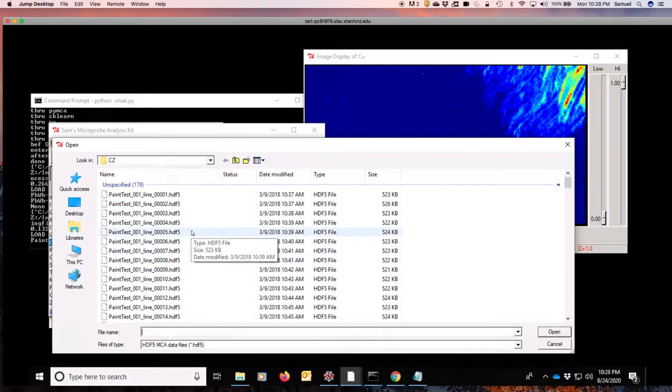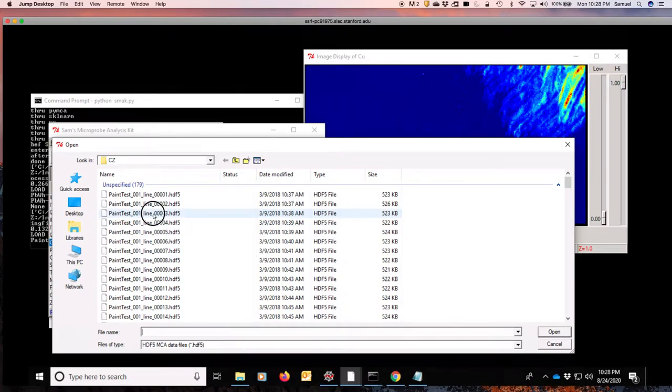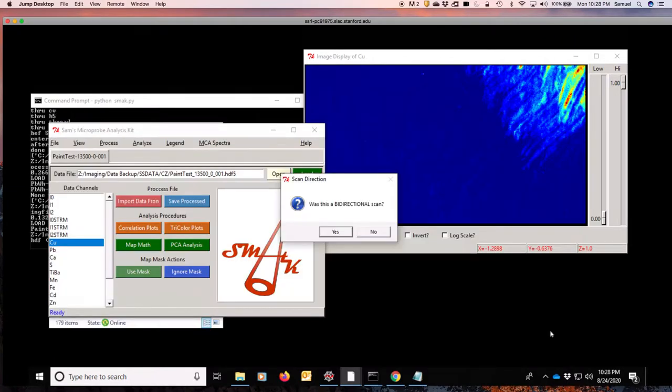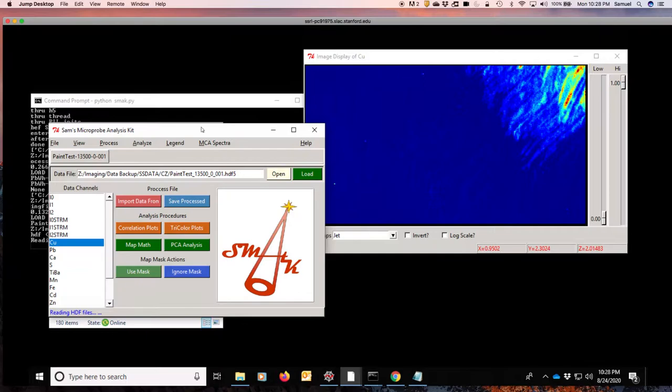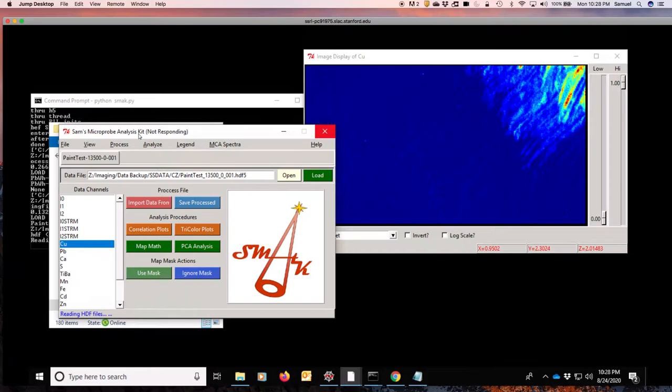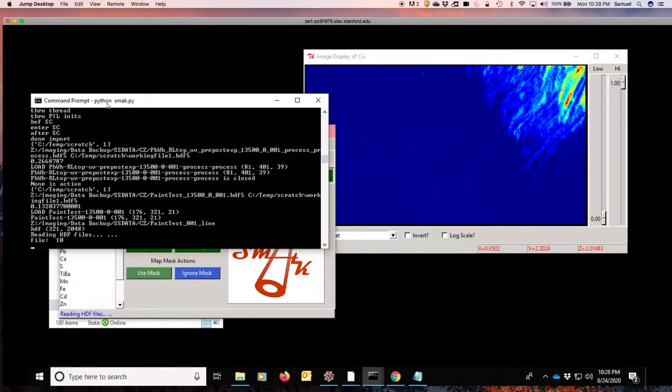Again, just like in the MCA spectra, we will pick any particular file out of the line of the file that we're interested in. I'm going to grab that one. And it will now go through and ask us some questions. It first asks us if this is a bidirectional scan. Were we doing bidirectional or continuous? In this case, the answer is no.